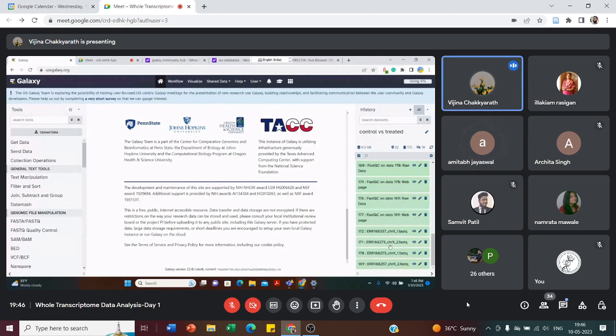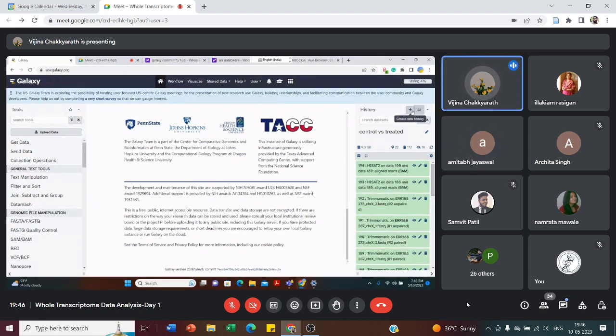If you want to do any new analysis, you can create a new history here, after clicking this plus symbol.